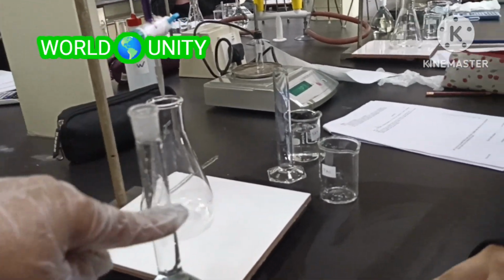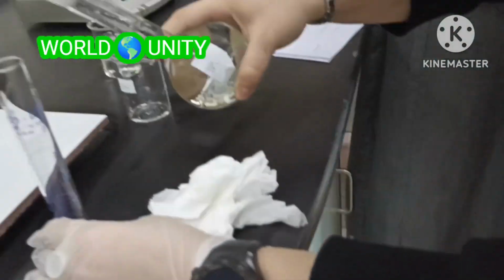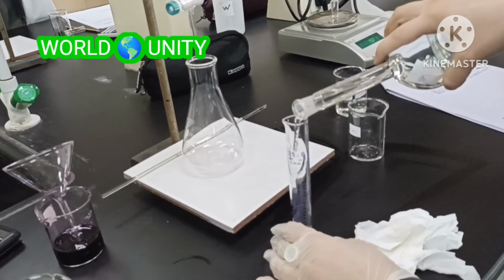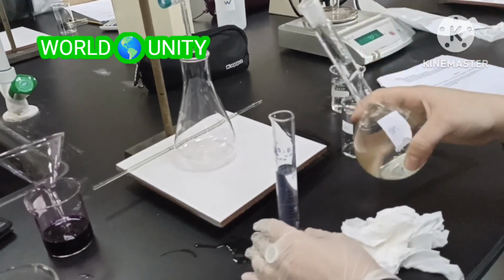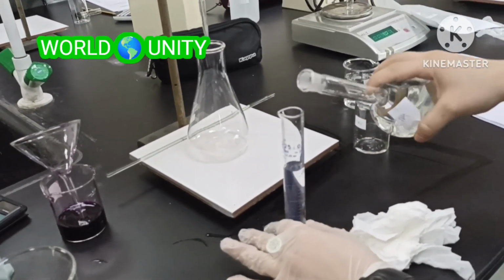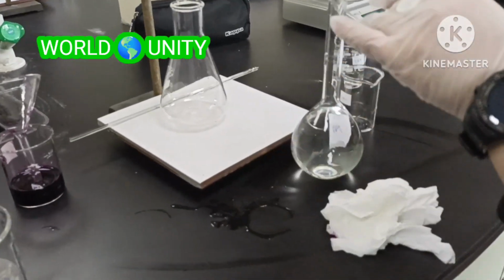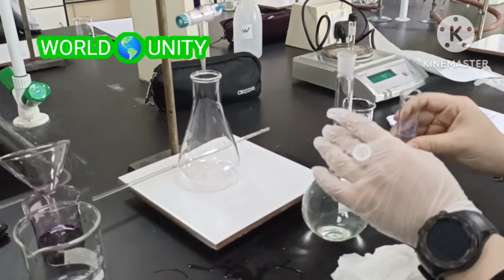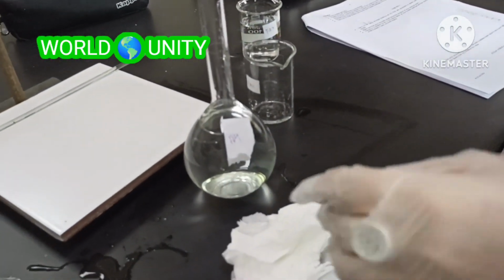Take 25 ml from here. Put, yeah, 25 ml. Until 25. Oops, girly, be careful. Okay. That's okay. You rinse a little bit, darling.